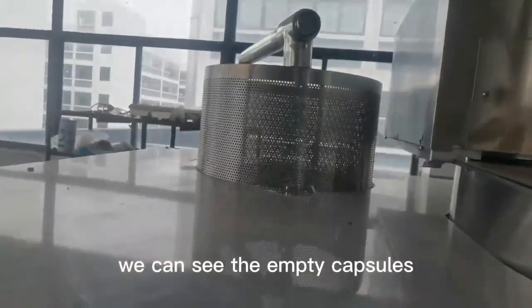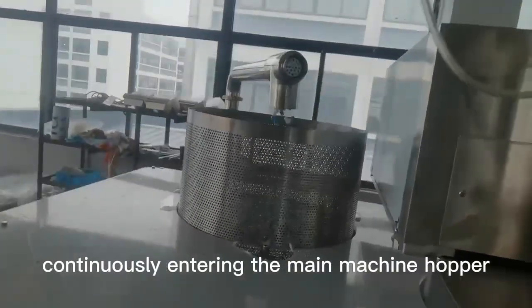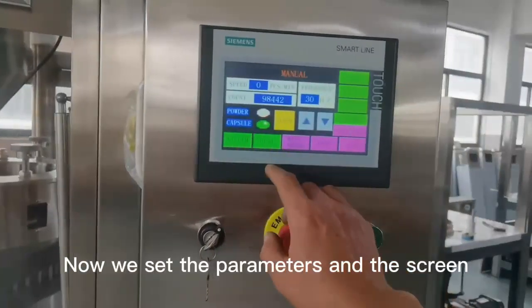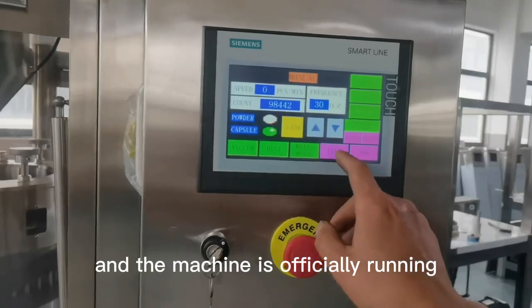Now we start operating the machine. We can see the empty capsules continuously entering the main machine hopper. We set the parameters on the screen and the machine is officially running.